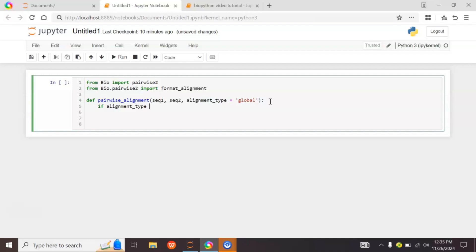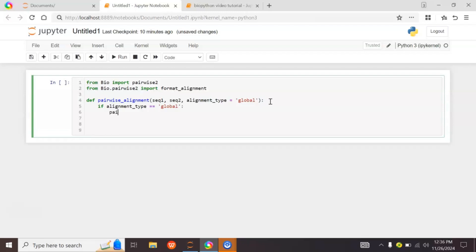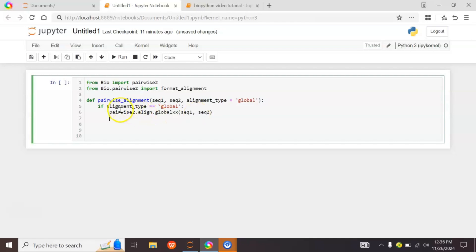If alignment_type equals global, we use pairwise2.align.globalxx and provide sequence1 and sequence2. The globalxx function uses only match and mismatch values — plus 1 for a match and 0 for a mismatch — and does not penalize gaps. This line performs all possible alignments between sequence1 and sequence2, storing the results in a variable called alignments.